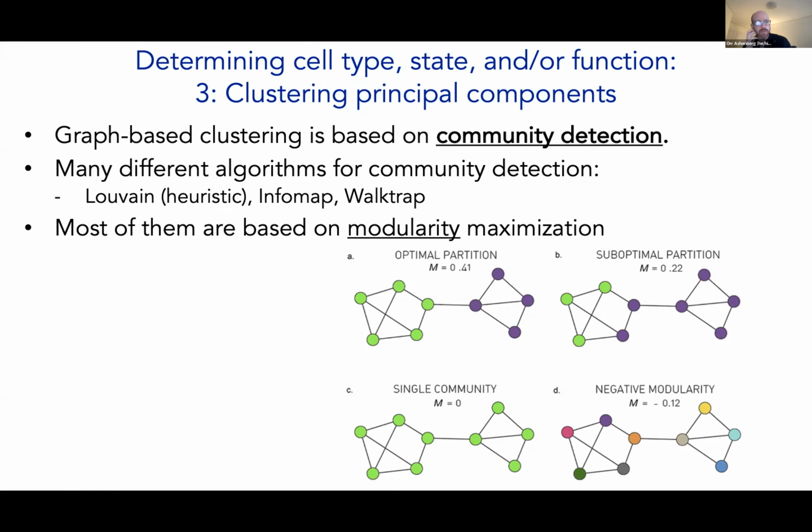I wouldn't do much more than that because they often are different, but not drastically different. The other thing is, within a clustering method, there are parameters you can change that will change the outcome of the clustering. So trying different methods is good, but even within the same method, you can get different results depending on some of the parameters that are set. There are examples of this in the lab today. We probably won't run through it, but you can run it yourself and see.